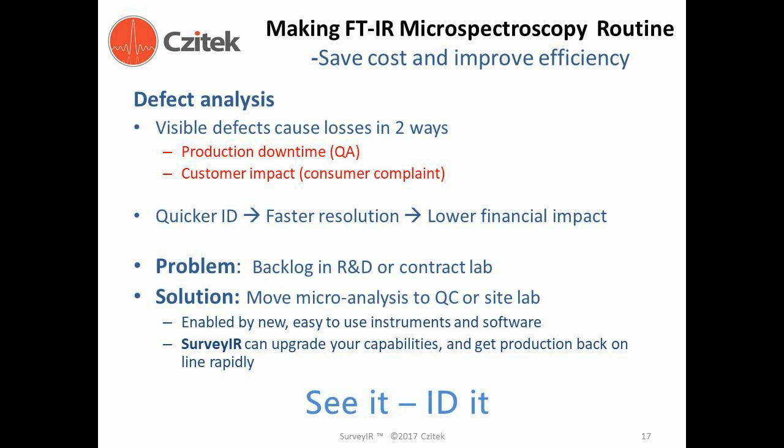Another way that financial impact is realized is through customer or consumer complaints. A more rapid identification of the defect through infrared spectral analysis leads to faster resolution and a lower financial impact. One of the issues facing many producers is backlog in their centralized laboratory or in contract labs that are used for infrared microspectroscopy analyses.